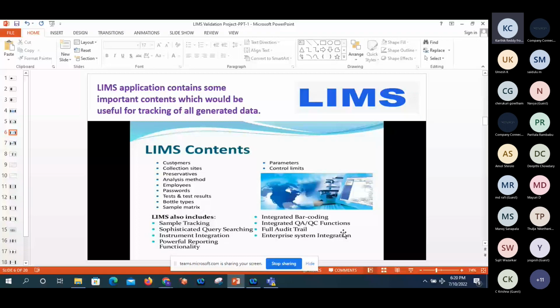It should be unique, and people can easily take the printout and affix it to that particular sample or bottle. Majorly people from QC, quality control, can be involved. QA people review and approve those generated samples and lots.